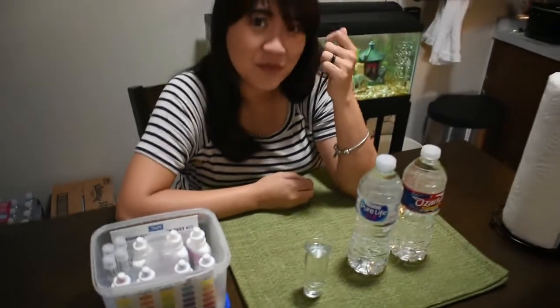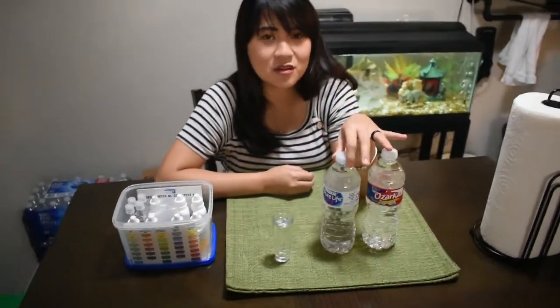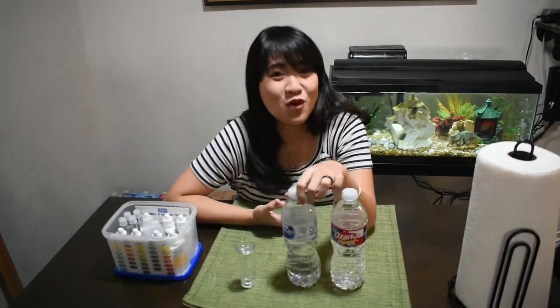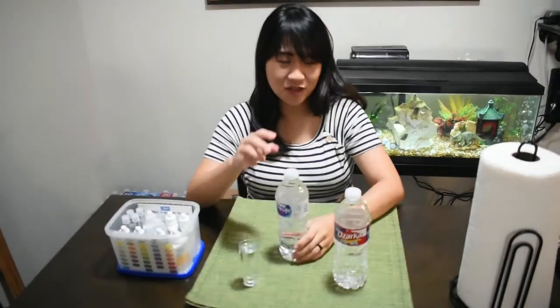First, because I have an aquarium, and we kind of started a new aquarium, and that's what I told you in the last vlog, that we are still doing the first aquarium. It's still cycling, so I need to do tests all the time until the pH, ammonia and everything look perfect for my fish, so they don't die. So I have an idea: why don't I try to test my water, because this is the water I usually drink.